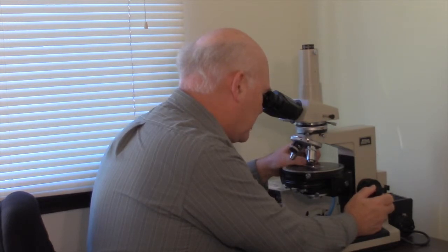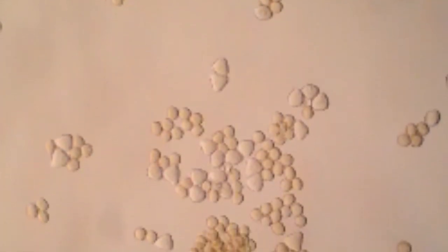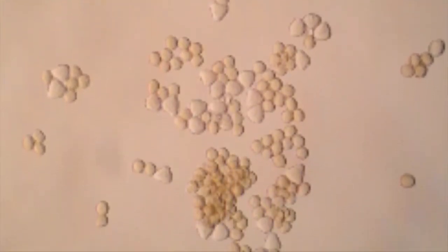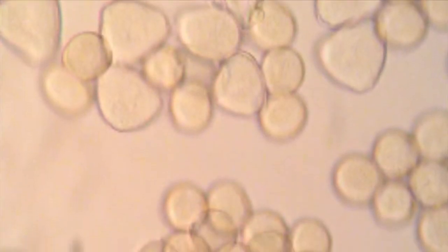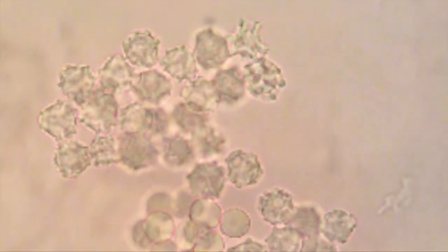Now in looking at the pollen grains, we can see that there are a couple of different types of pollen here. Kind of scan around, looking at the different pollen types, see which ones are most common.